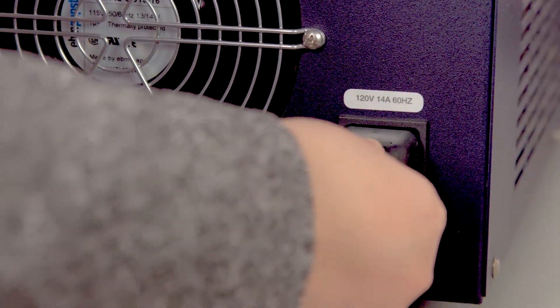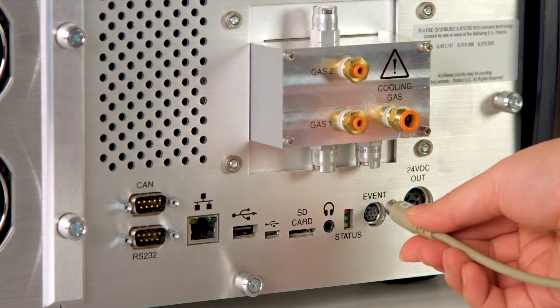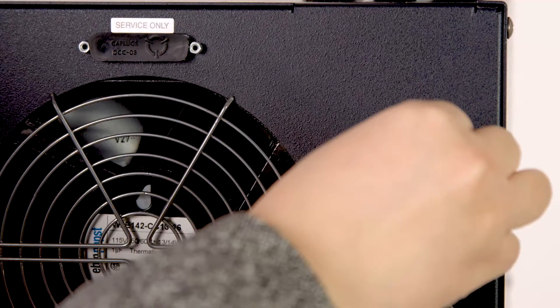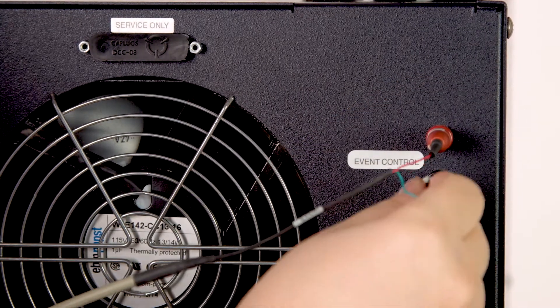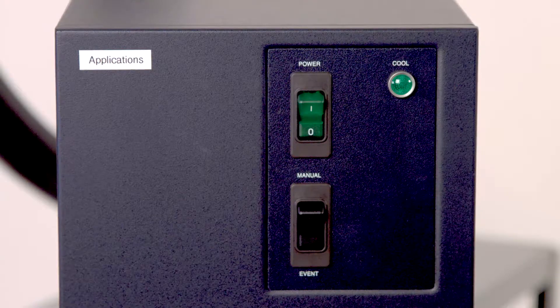Connect the main cable and the event cable to the back of the DSC. To the RCS, use the red and black electrical connectors. Make sure the event and menu switch is on event.